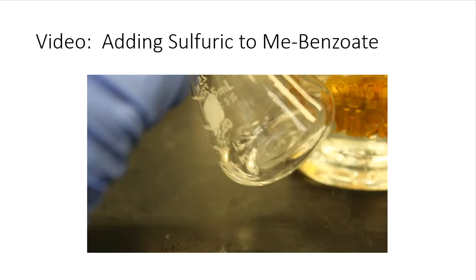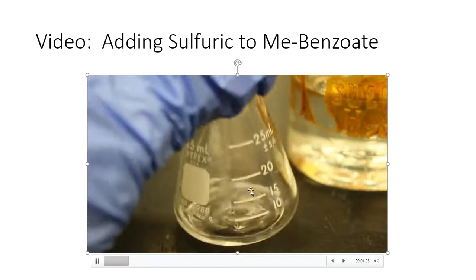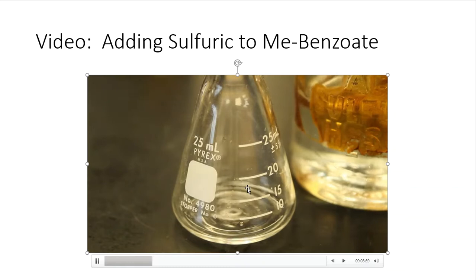And then here is our final one, which is adding sulfuric acid to methyl benzoate. Now, keep in mind, methyl benzoate was already a liquid. There it is. I didn't have to worry about a solid with this one. And I'm getting ready to add sulfuric acid to it. So let's see if this looks any different.